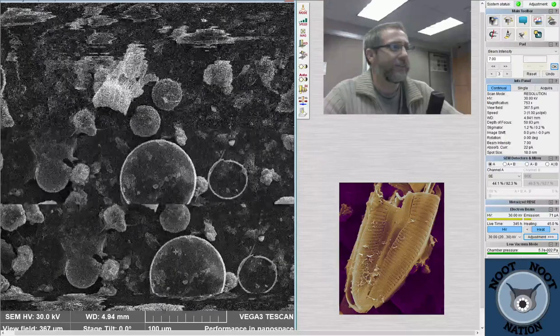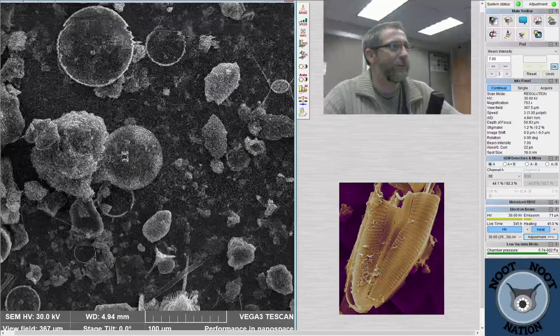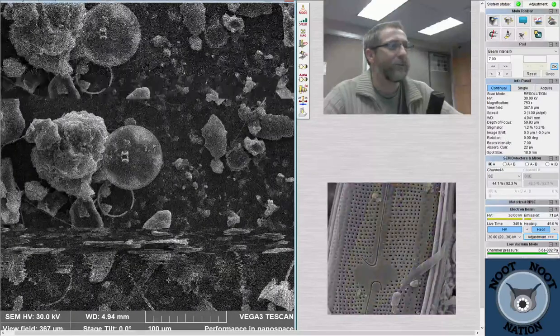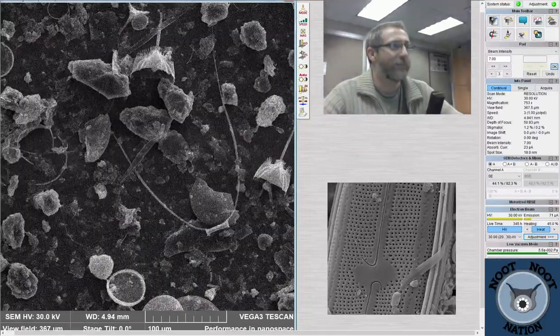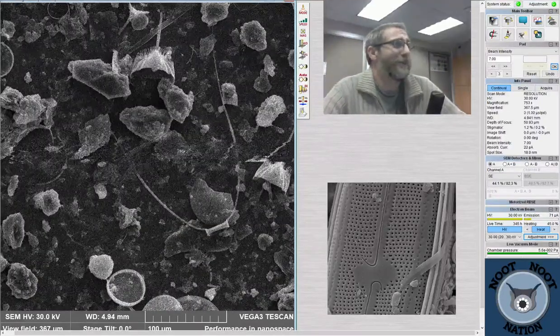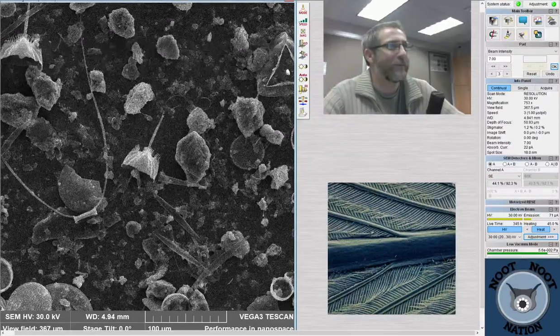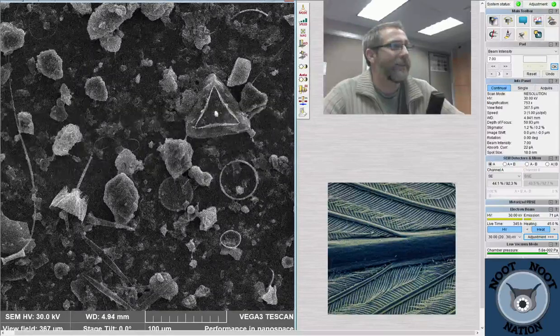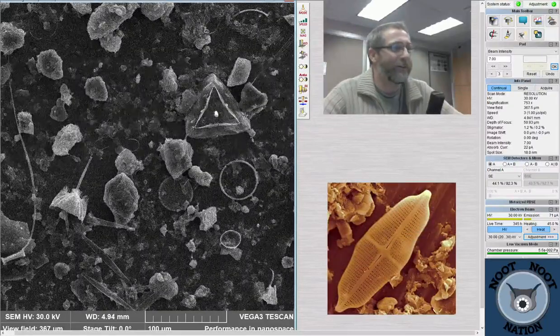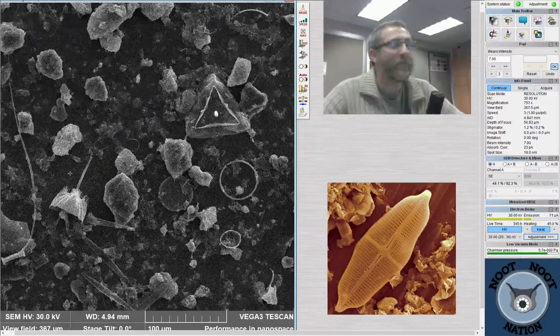characterized. So this one, I think, is, again, the perforatus that we looked at before, the Coscinodiscus. It's a whole bunch of Latin names. And the good news is if I get them wrong, none of you probably know what it is. Unless my friend Anna shows up, who's actually a marine diatomist, then I could probably just make names up and you guys would be like, oh, cool. But I won't do that, or I'll try not to.